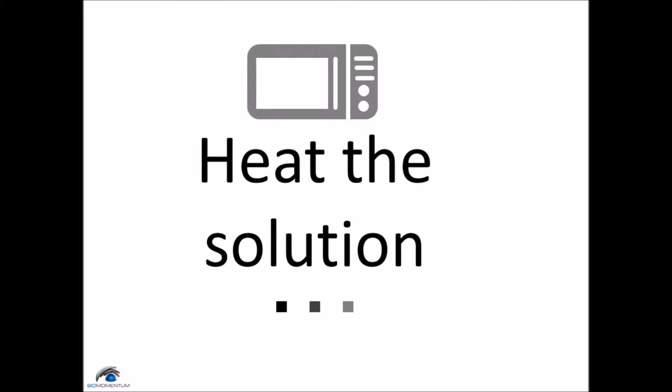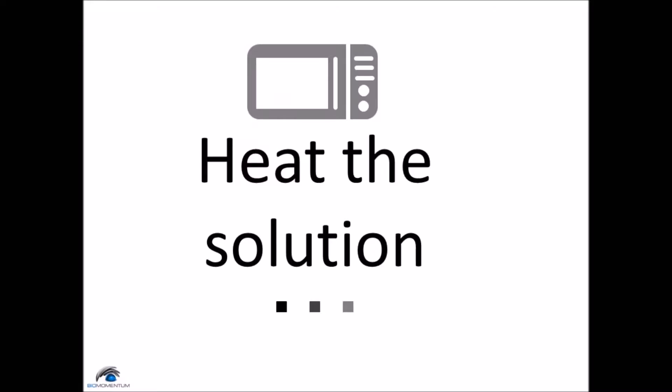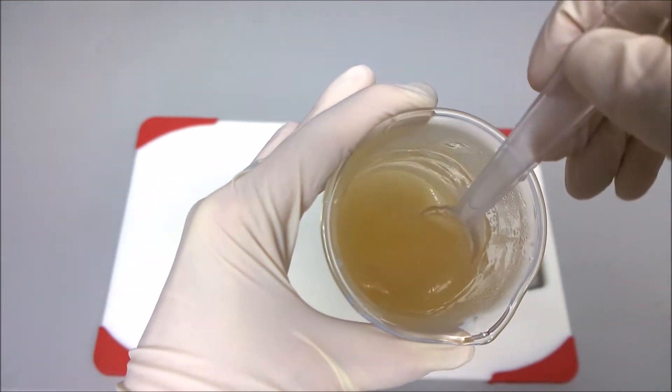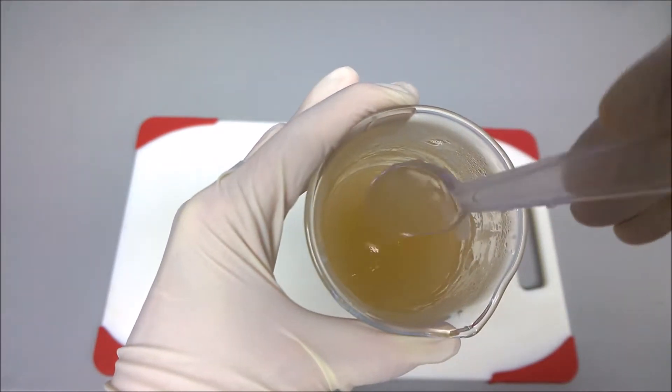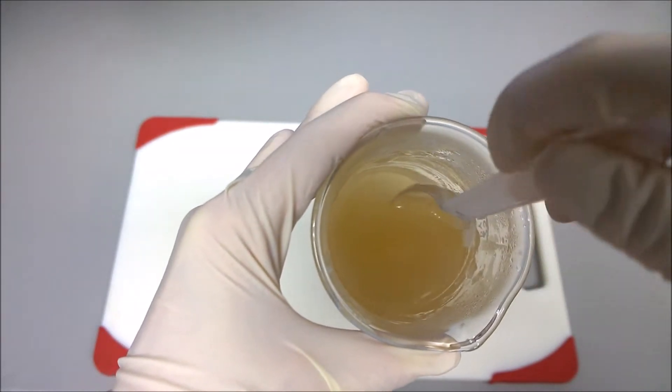Heat the solution for 30 seconds and stir. Then heat the solution for 10 second intervals, stirring in between until complete melting of the agar and thickening of the solution. Do not let the solution boil because air bubbles will form.